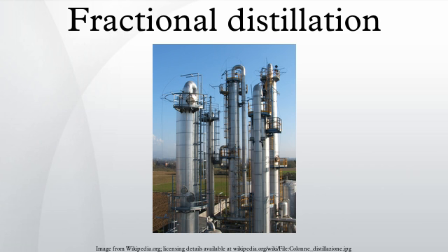A Perkin triangle as an alternative apparatus is often used in these situations because it allows isolation of the receiver from the rest of the system, but does require removing and reattaching a single receiver for each fraction. Vacuum distillation systems operate at reduced pressure, thereby lowering the boiling points of the materials. Note that the use of anti-bumping granules will not work at reduced pressures.